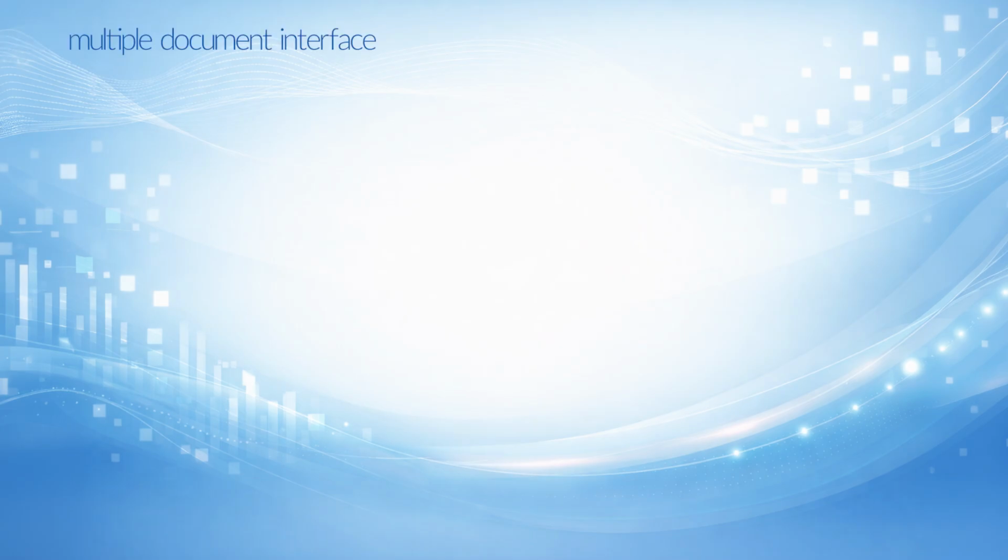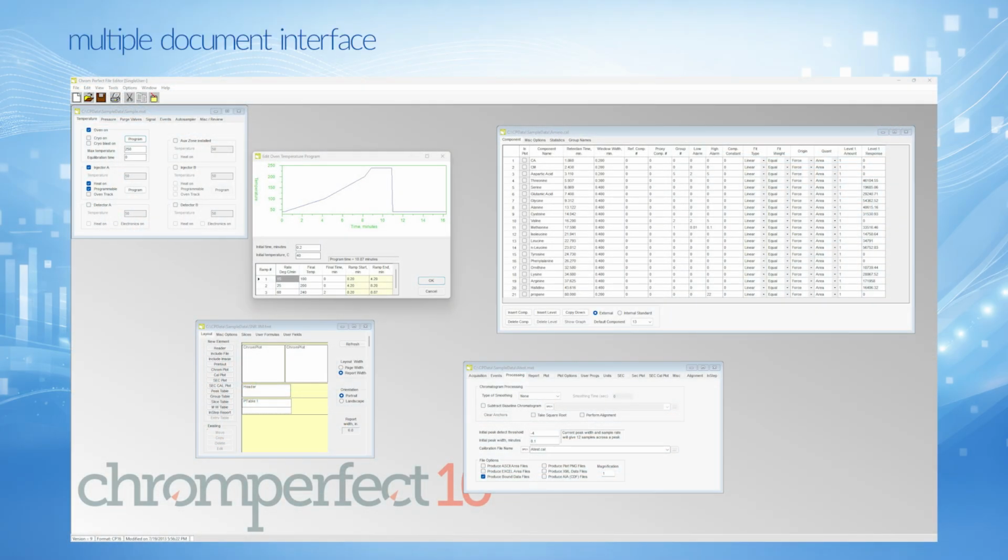Multiple Document Interface. The file editor uses a Multiple Document Interface, or MDI. This means that several files may be open for editing at the same time, each in its own editing form.